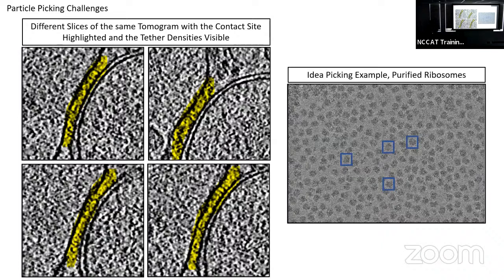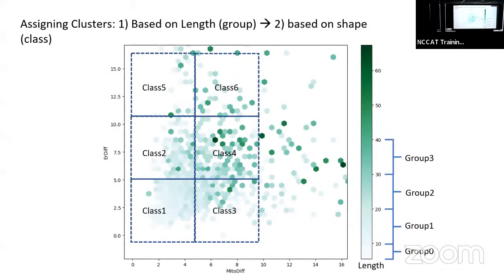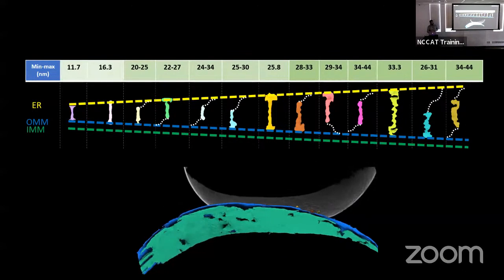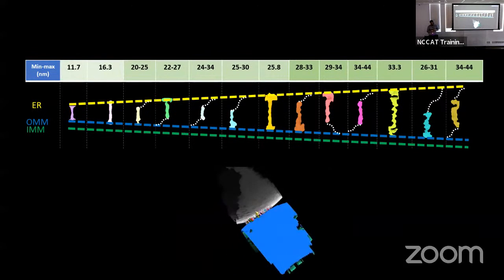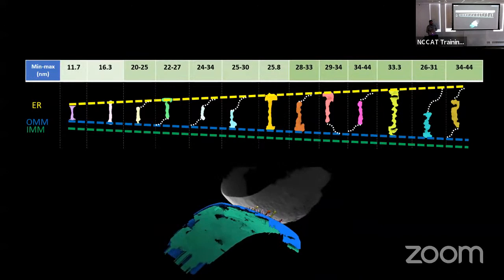From there, Dynamo actually takes care of it. When you extract them, it calculates their Euler angles. So after you extract and average them together, they are all already aligned. Without any alignment or classification, you actually get densities out of the tomogram. And so they're not biased, there's no reference to bias it.